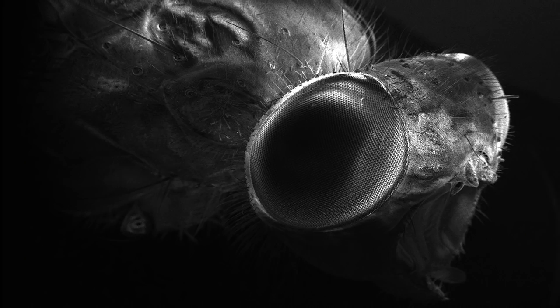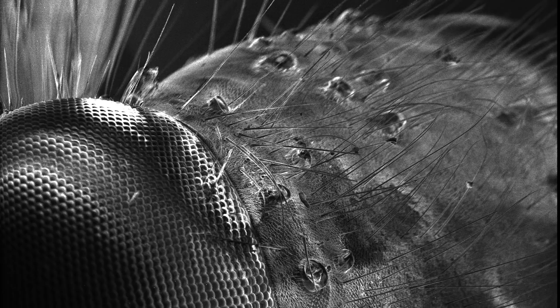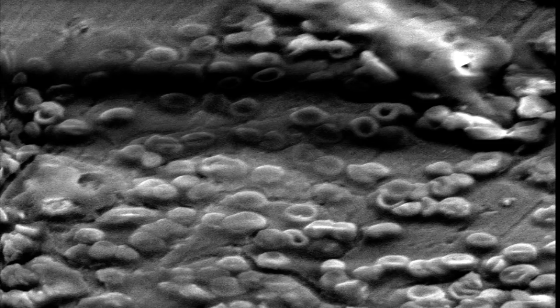Here's an image of a house fly that I captured without actually coating the fly with metal. Typically non-conductive specimens have to be sputter coated with metal to show up well. However this is just a dried out fly. Here's a close up of the fly's eye and head area.